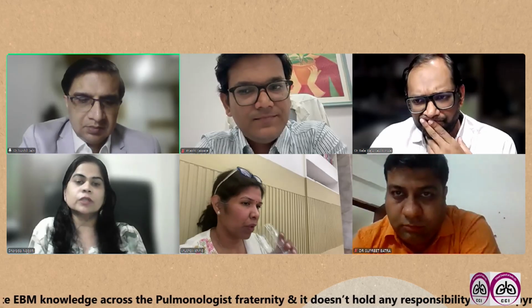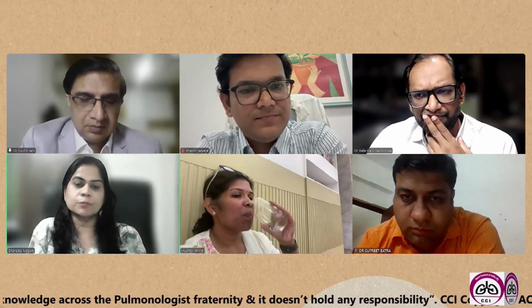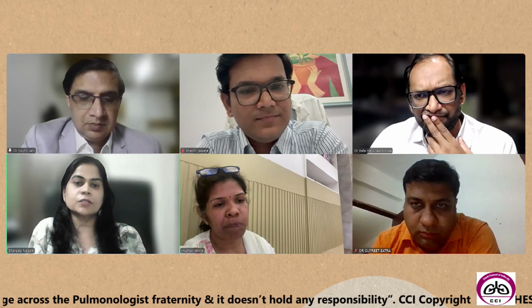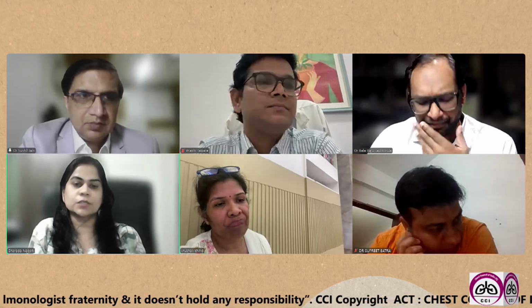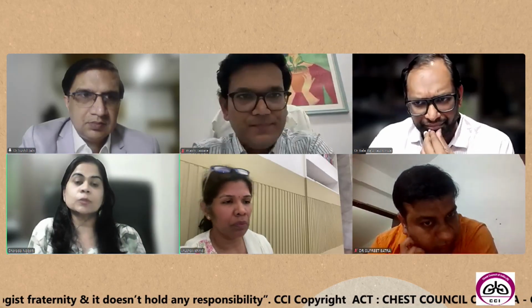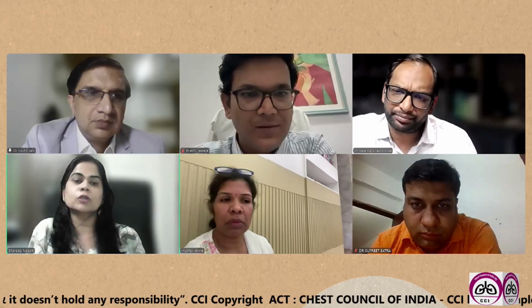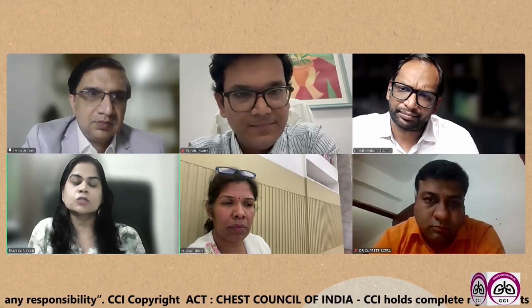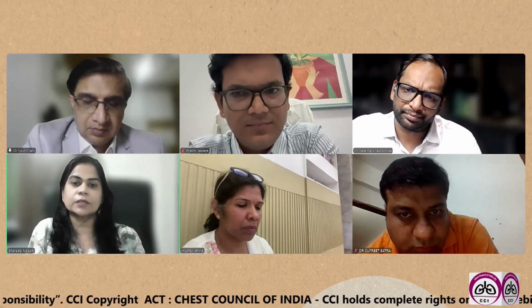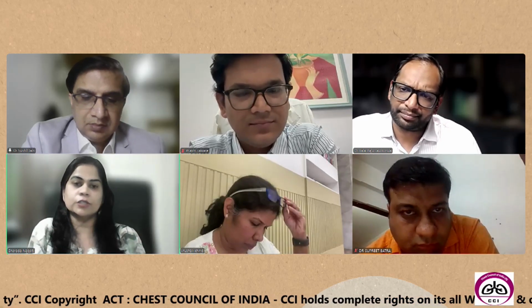For both, if there is lesional material, whether granuloma or malignant, the smears are considered adequate. The bronchial epithelial cells in the smear should not be more than 2 clusters per low power field. So these are the adequacy criteria for cytology.